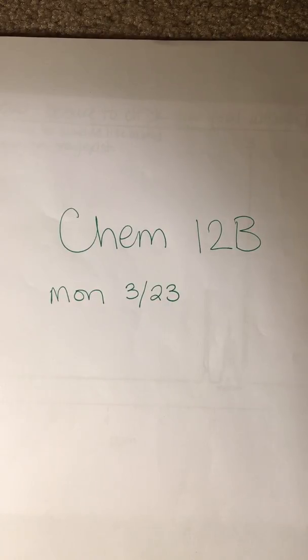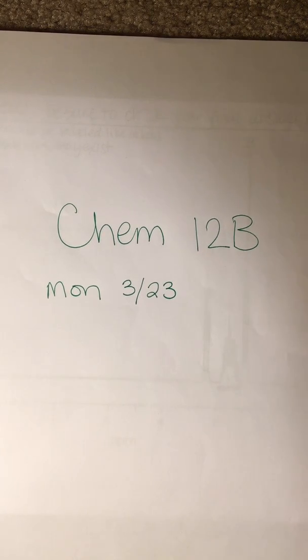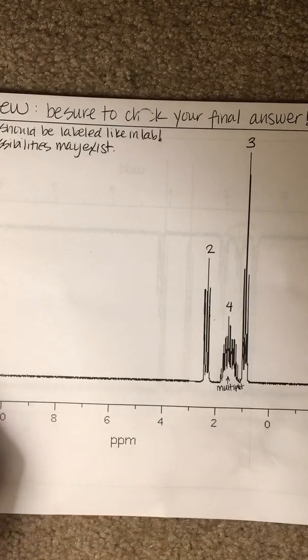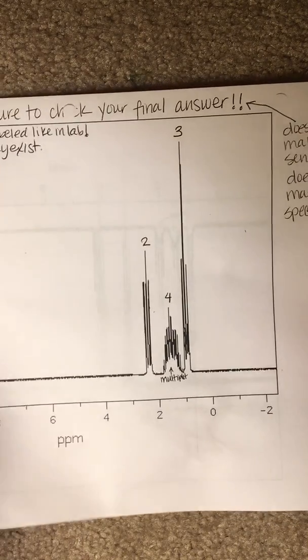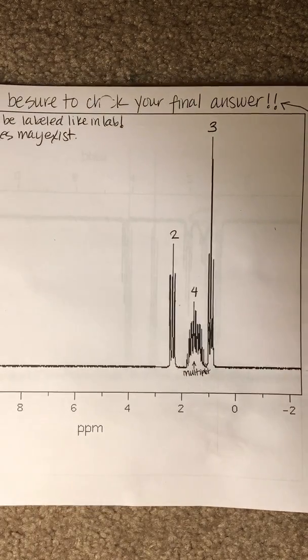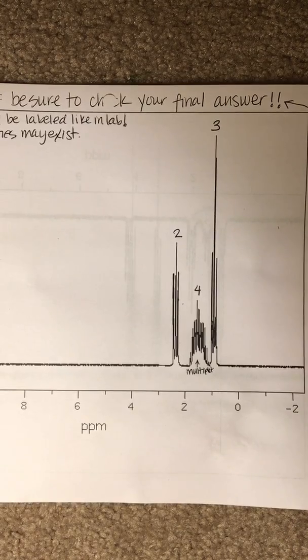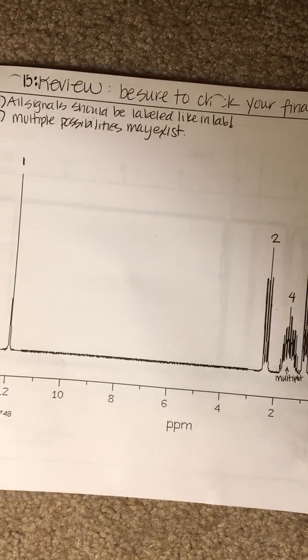Good morning, you guys. It is Monday, March 23rd, and our lecture today is continuing on with some NMR analysis. So your job is to be working through our packet, which you all should have gotten, I believe, before the school shut down. This little packet here has a bunch of NMR analysis in here. This video will be analyzing some of the spectra in here, and then your job will be to complete it.